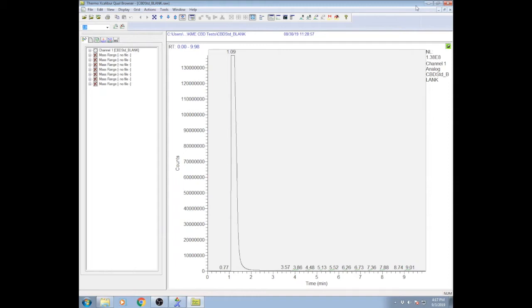The important thing is, in the top of the chromatogram window, there's that green thumbtack looking icon. Make sure that for the window you're interested in, that thumbtack is highlighted green. If that's the case, then you're ready to manipulate the data. You can zoom in and you can zoom out and you can change things in the data.